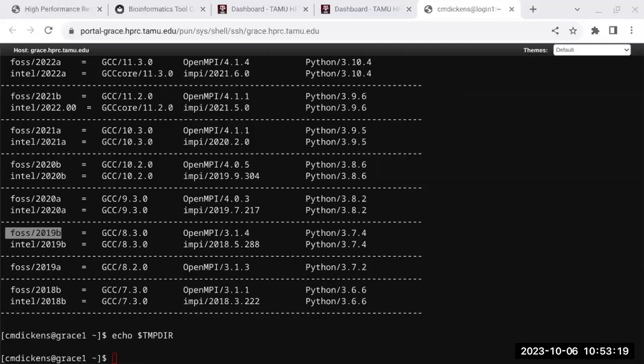Normalization is good. Some people say, I don't want to throw out data. I don't want to use all the data I get. It's wrong to throw out data. Well, it's not wrong. For example, some software will say, we recommend 50x coverage to do this analysis. And if you sequence a bacterial genome on a HiSeq and you get 3000x coverage, you need to find some way to normalize that data down to 50x. If the developers of the software recognized that 1000x or 3000x coverage would be better, they would say 50x is good, but if you have 3000, that's better. But usually they don't. So you want to scale that down.